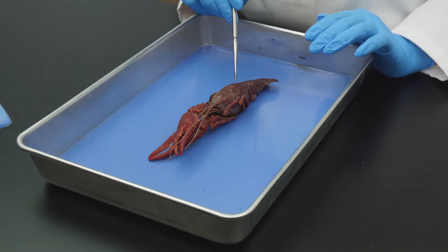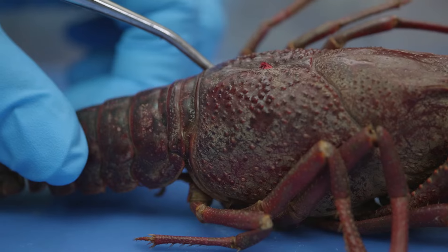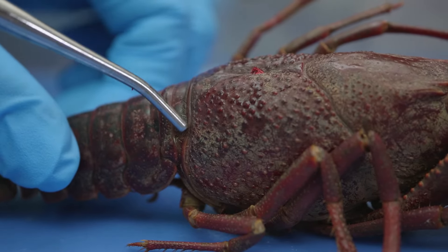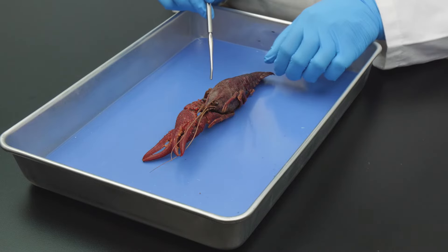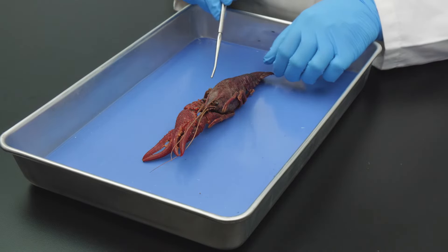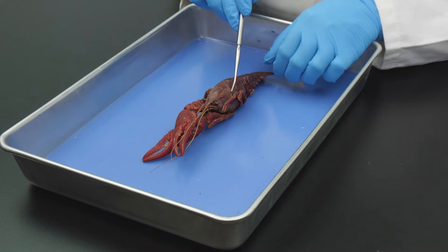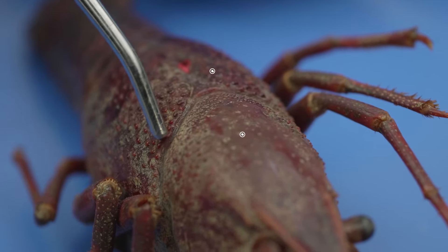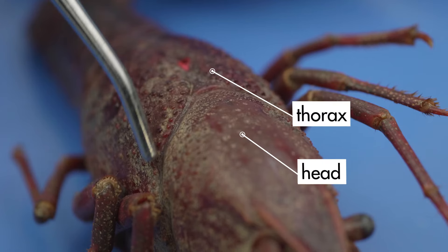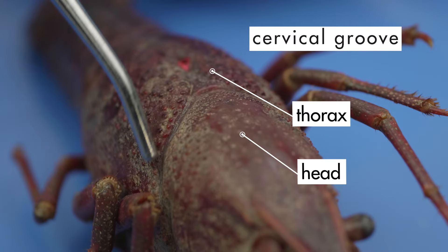The exoskeleton has a movable joint between the cephalothorax and the abdomen to allow the crayfish to move its tail. Although the head and thorax are fused into a single segment — the cephalothorax — there is a visible boundary between the head and the thorax called the cervical groove.